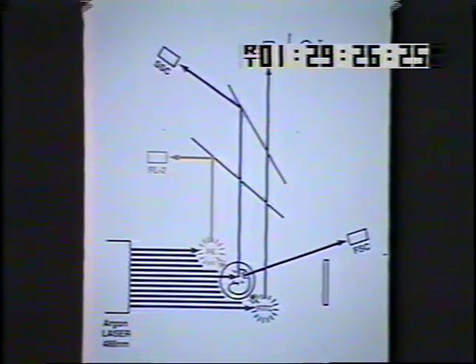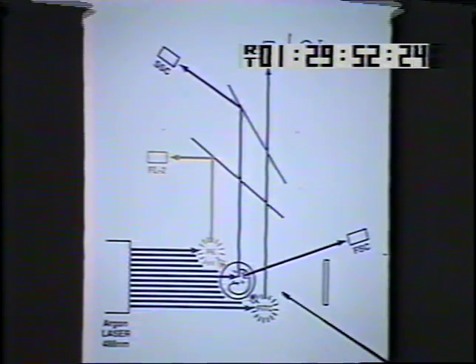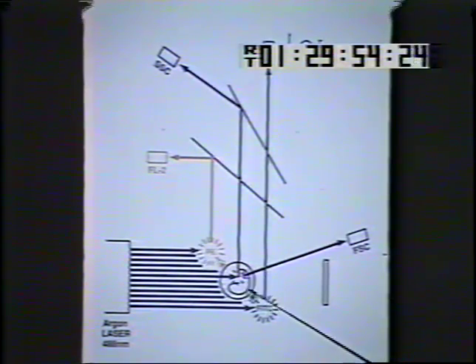This diagram is a representation of the heart of a flow cytometer. We can see the light source which is shining on a cell. This cell is permitting, when in the light beam, 5 separate measurements to be made. We can see that the light is being scattered, which is a measurement of size. It's also being refracted at 90 degrees, which is a measure of the complexity of the particle or the number of small organelles within the cell.